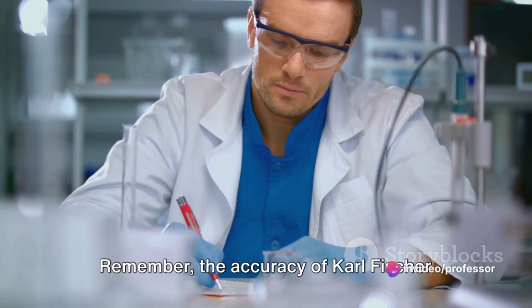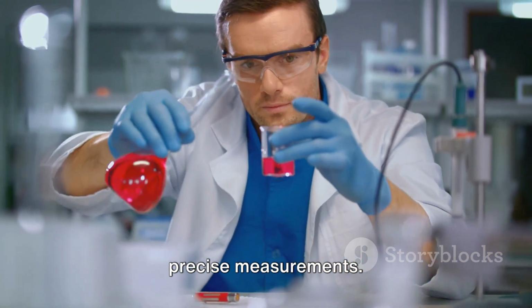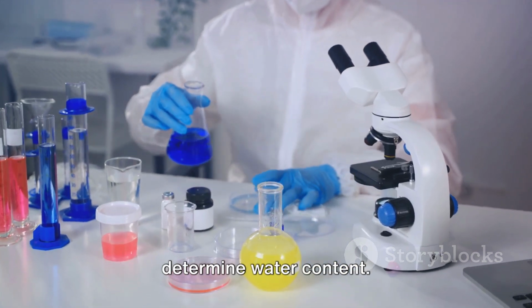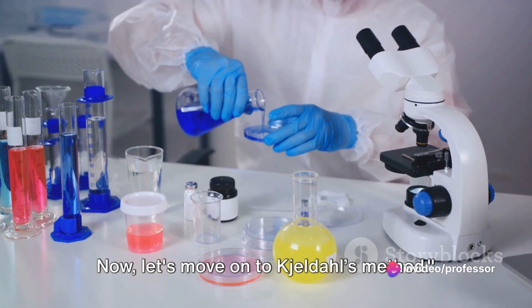Remember, the accuracy of Karl Fischer titration depends on careful sample preparation, meticulous titration, and precise measurements. But once you get the hang of it, it's a straightforward and reliable method to determine water content. So that's how we determine the water content in a substance. Now let's move on to Kjeldahl's method.